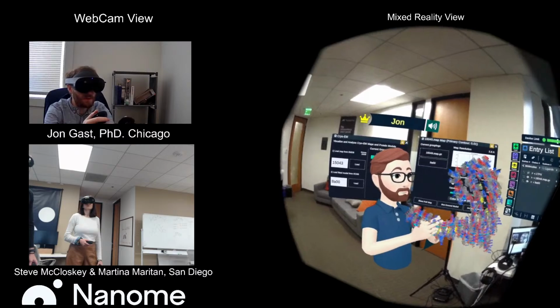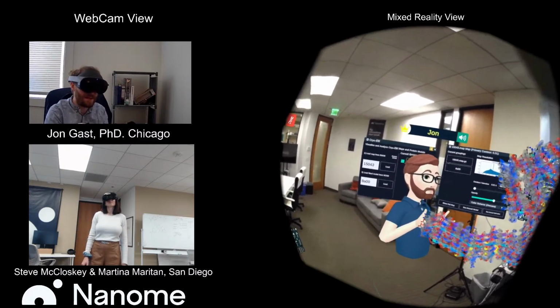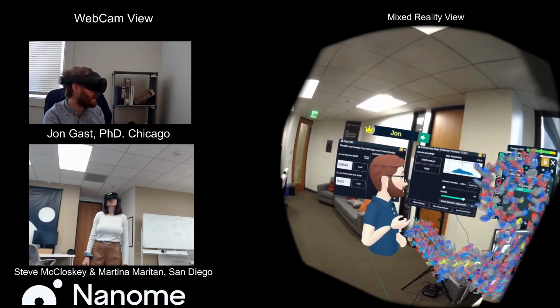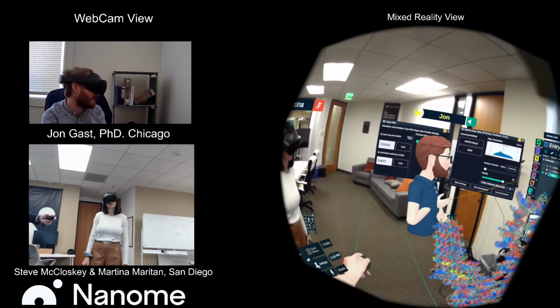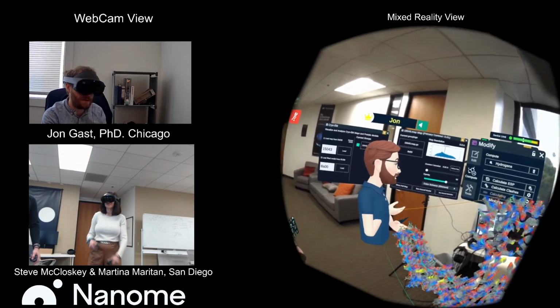And let's take a deeper look at all those things that Martina described as far as, while this is unfolded and misfolded, it's still highly ordered, a very strong structure that can be repeated. So let's look at some of the things that are contributing to that. And obviously, we can see here a number of beta sheets. And where there are beta sheets, we're going to have hydrogen bonds. So I'm just going to go into the modify menu and do a quick hydrogen bond calculation in Nano.